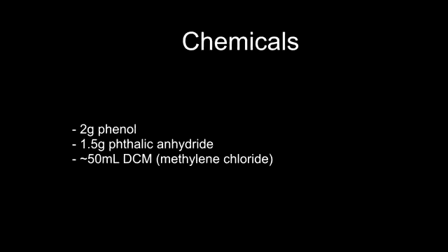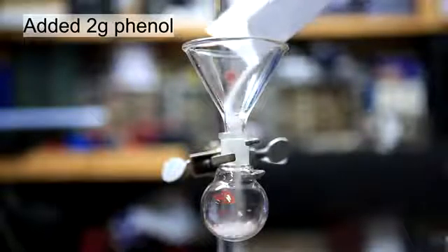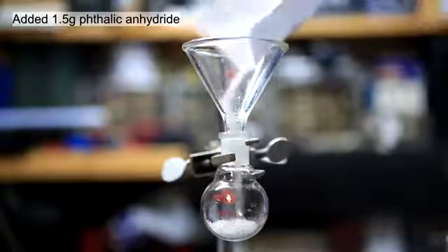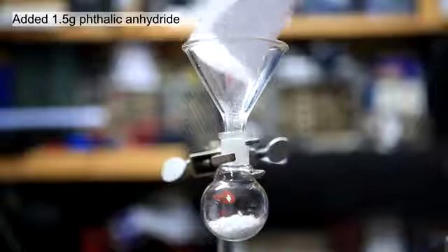As a side note, in previous videos I've shown how all three of these chemicals can be obtained from household products. 2g of phenol was added to a 25ml round bottom flask. This was followed by the addition of 1.5g of phthalic anhydride.